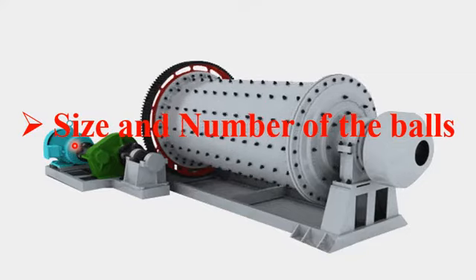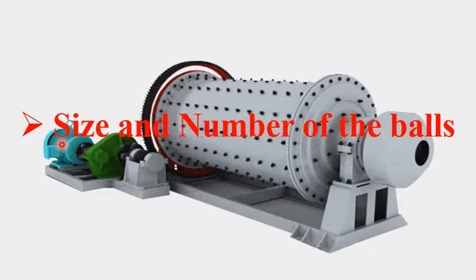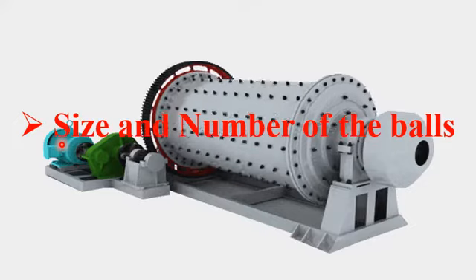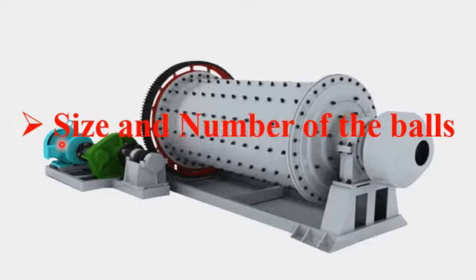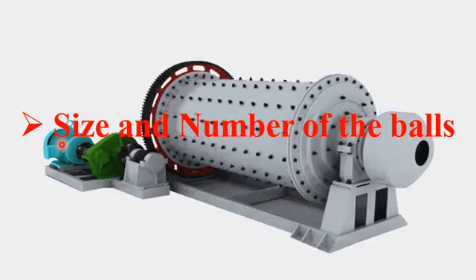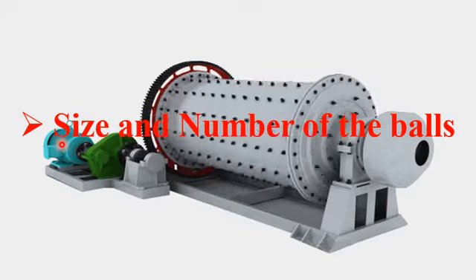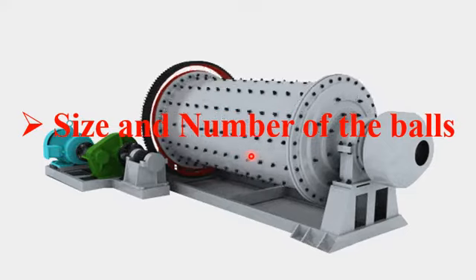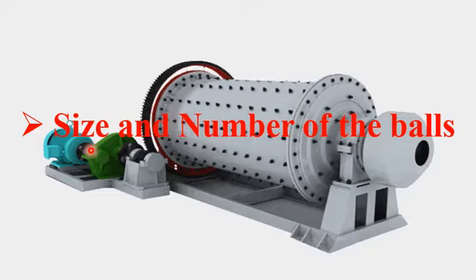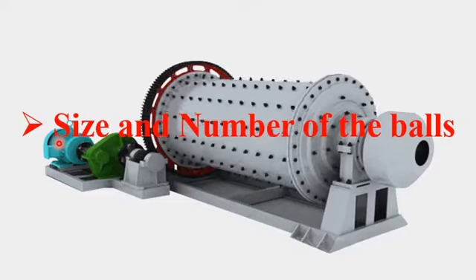However, if the bulk material is in the form of fine particles, then in ball milling we use smaller balls in order to convert the powder into very fine nanoparticles. So dear student, the larger balls in the ball milling process are used in breaking the bulk material.